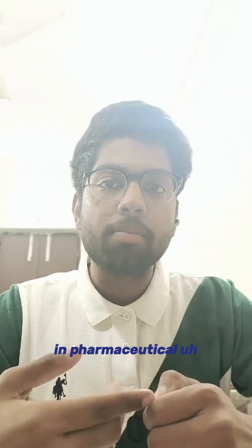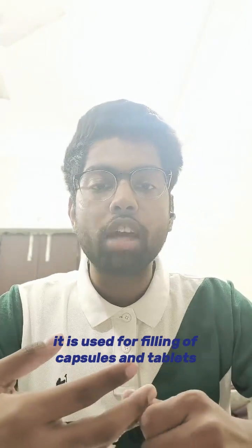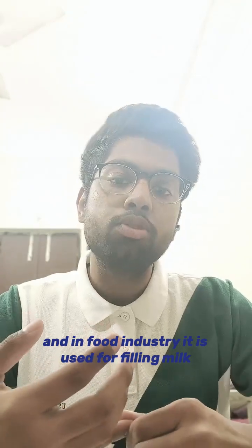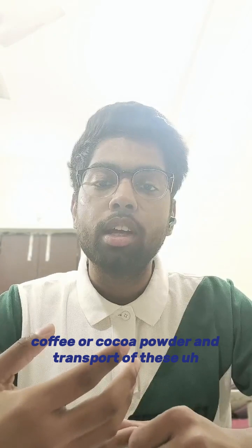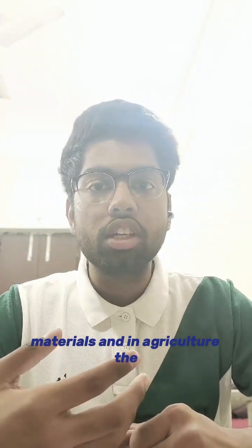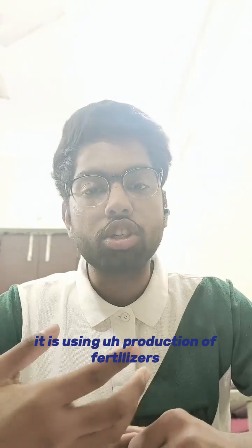In pharmaceutical, it is used for filling of capsules and tablets, and in the food industry it is used for filling milk powder, coffee or cocoa powder, and transport of these materials. And in agriculture, it is used in production of fertilizers.